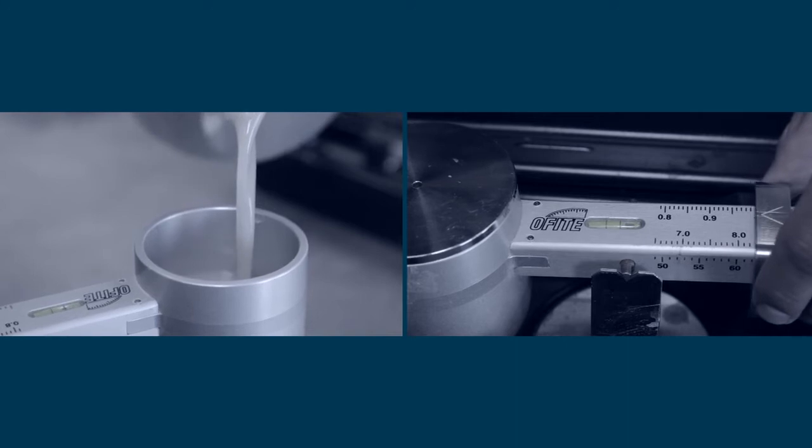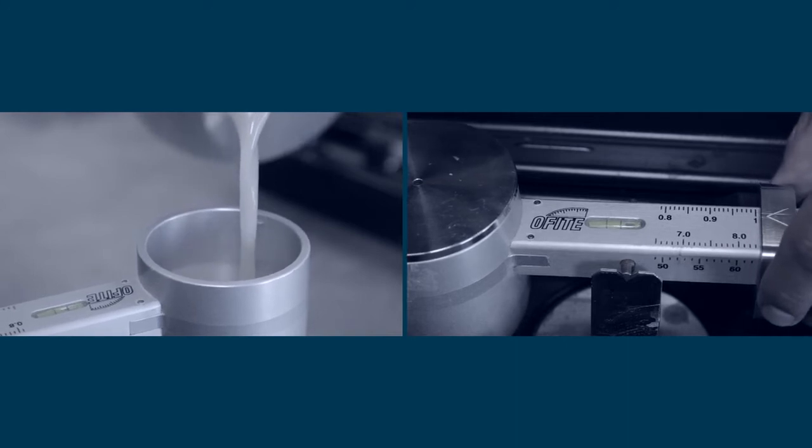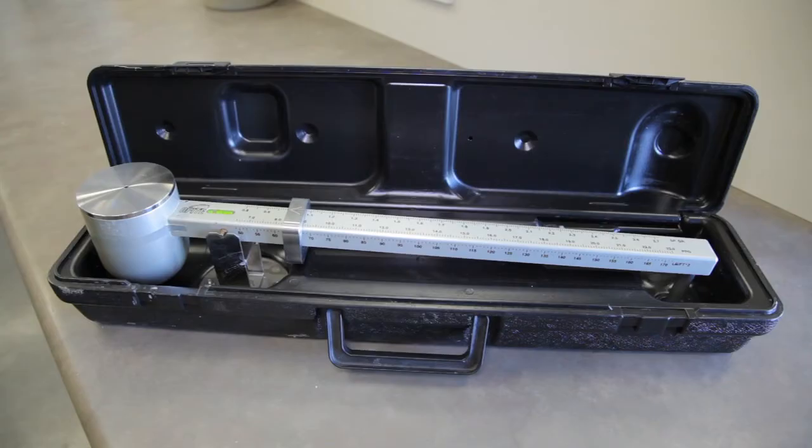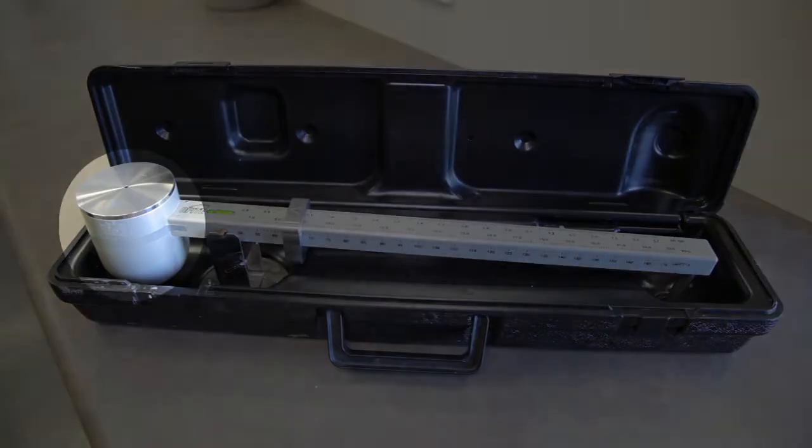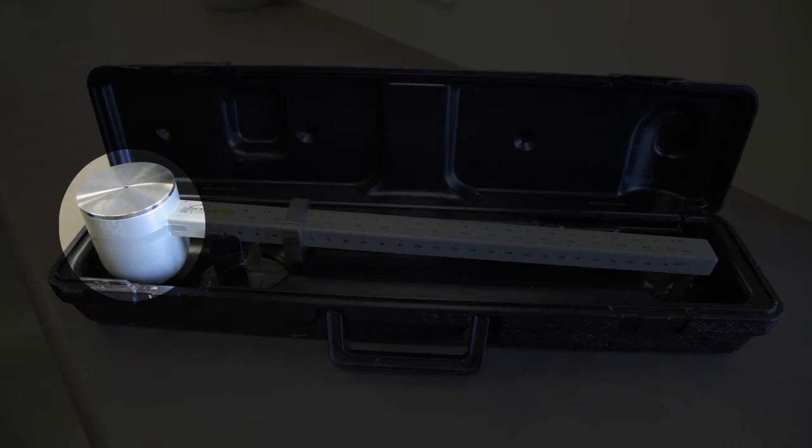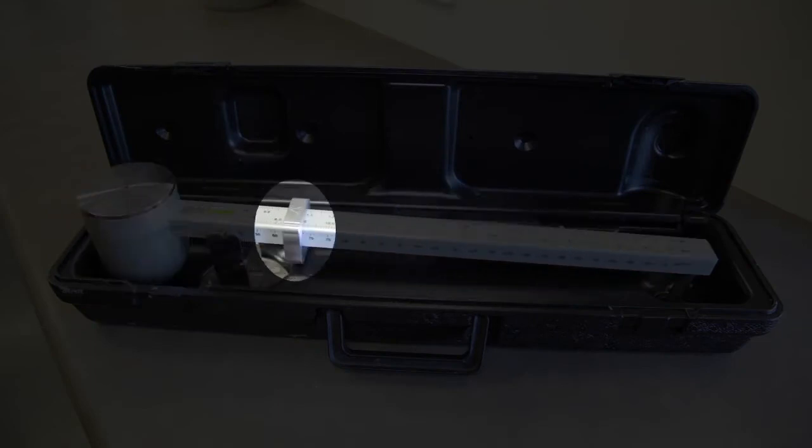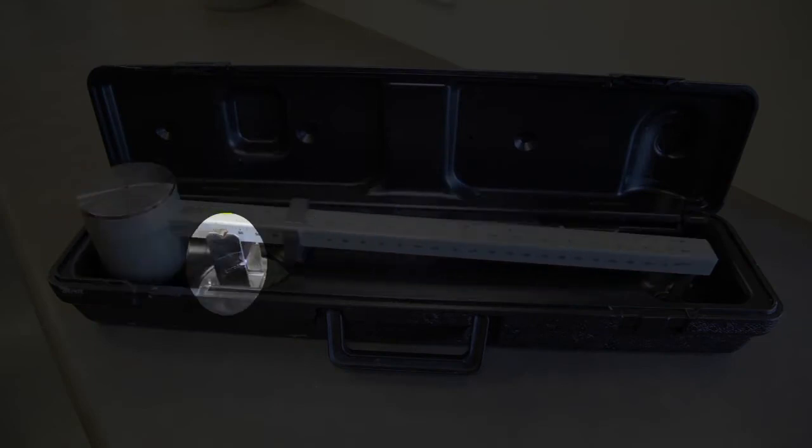This is a mud balance used to determine the weight of the drilling fluid. It consists of a chamber, the measuring scales, a sliding weight, as well as a fulcrum.